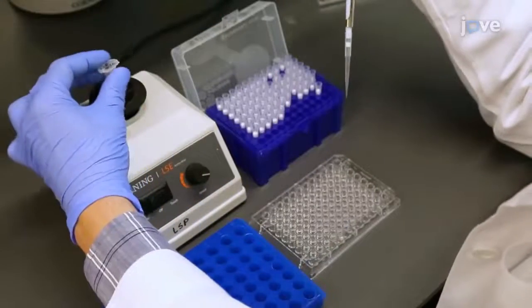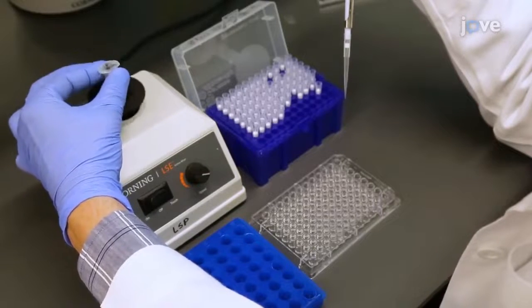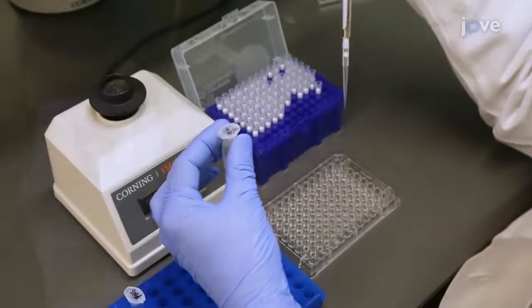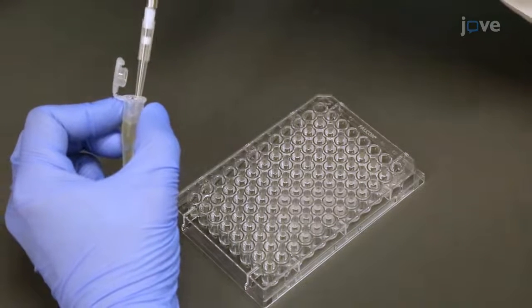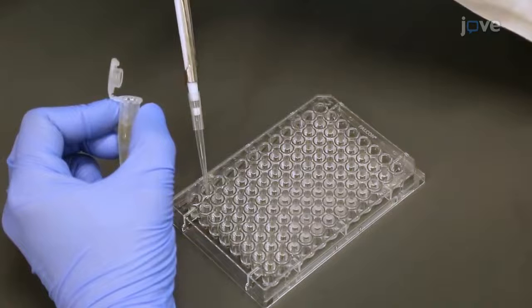Vortex the LB 10% sol for five seconds at the highest setting. Add 20 microliters of LB 10% sol to the top four rows of the wells in a 96-well microplate.